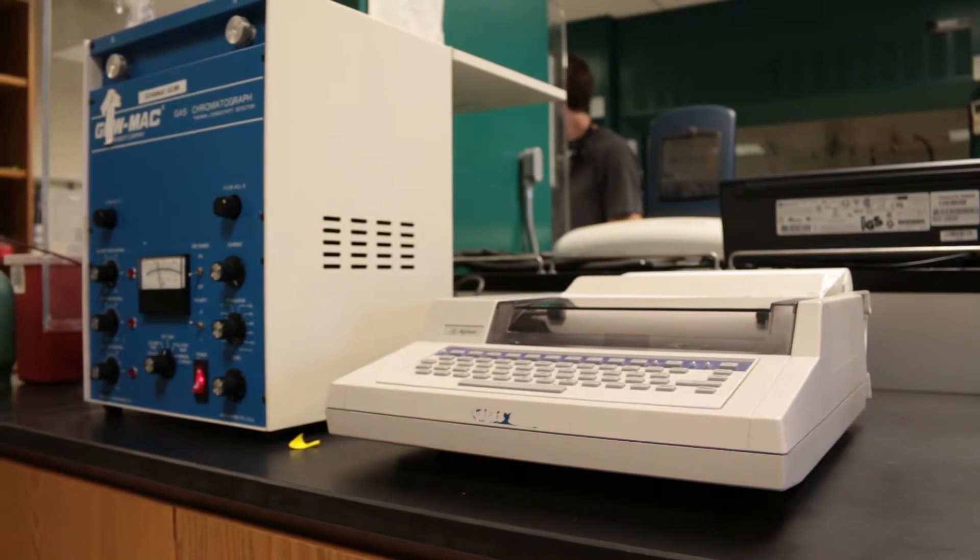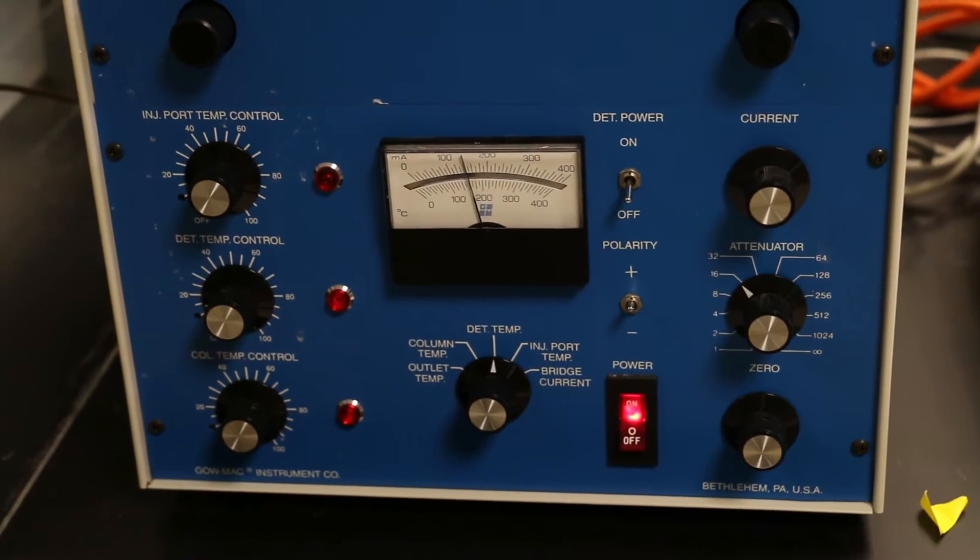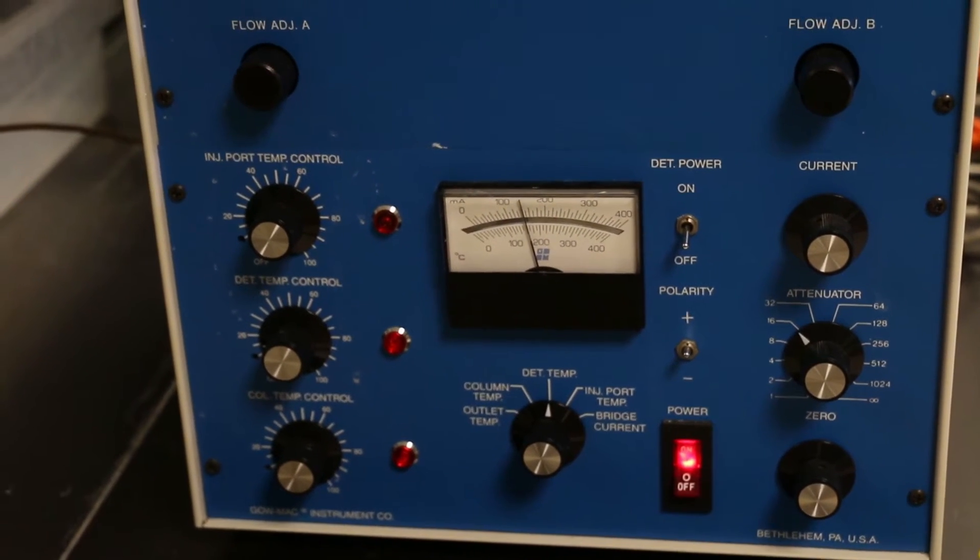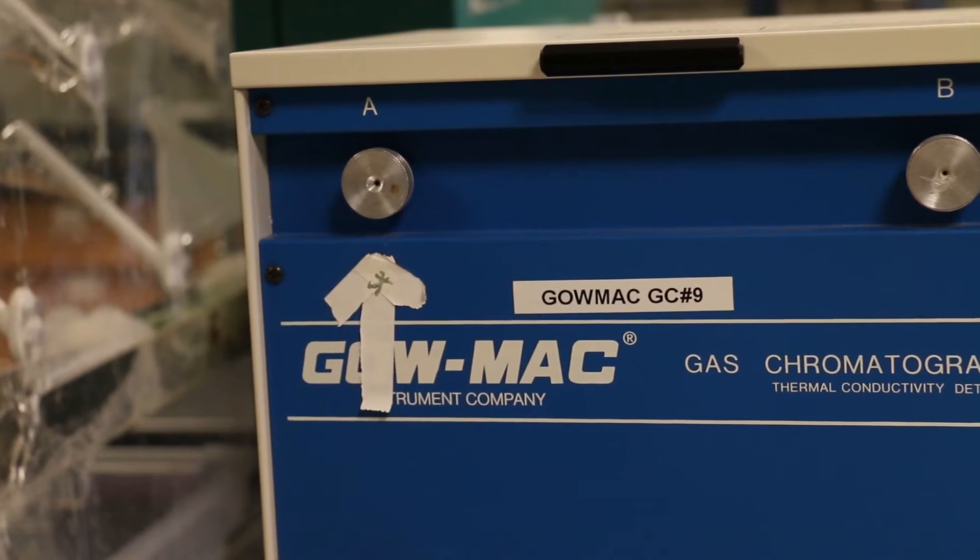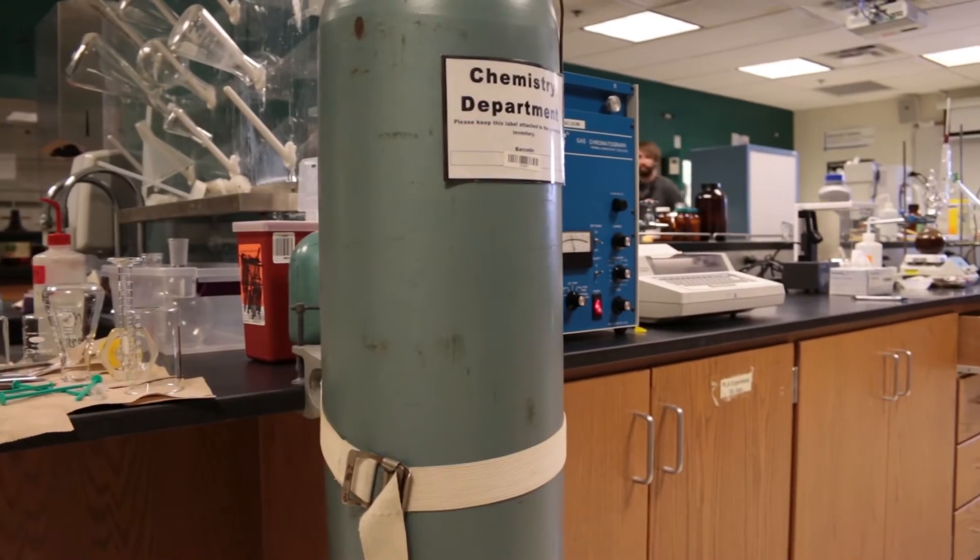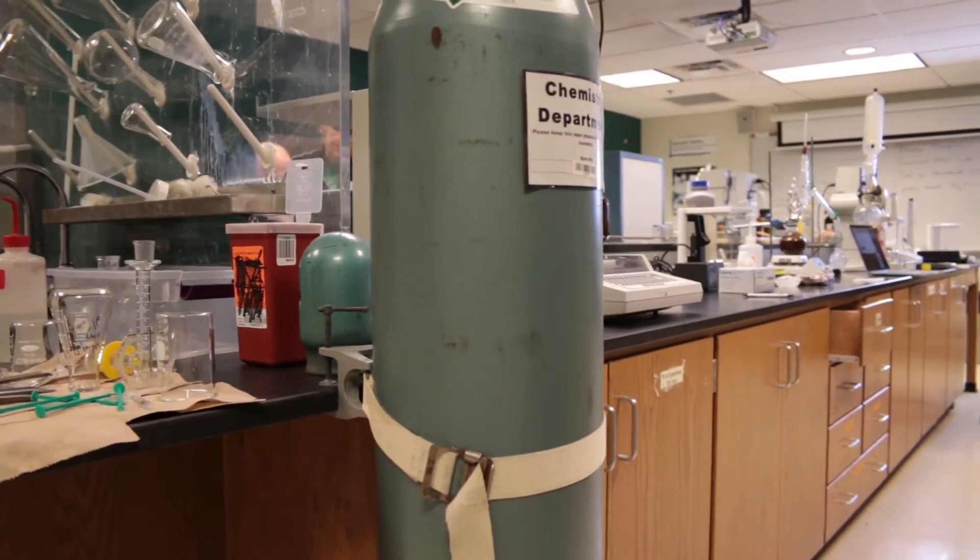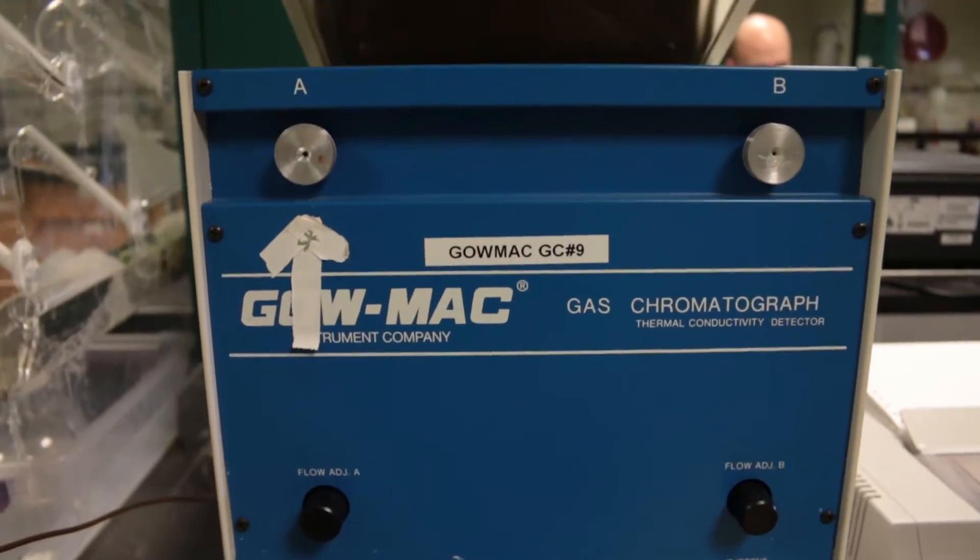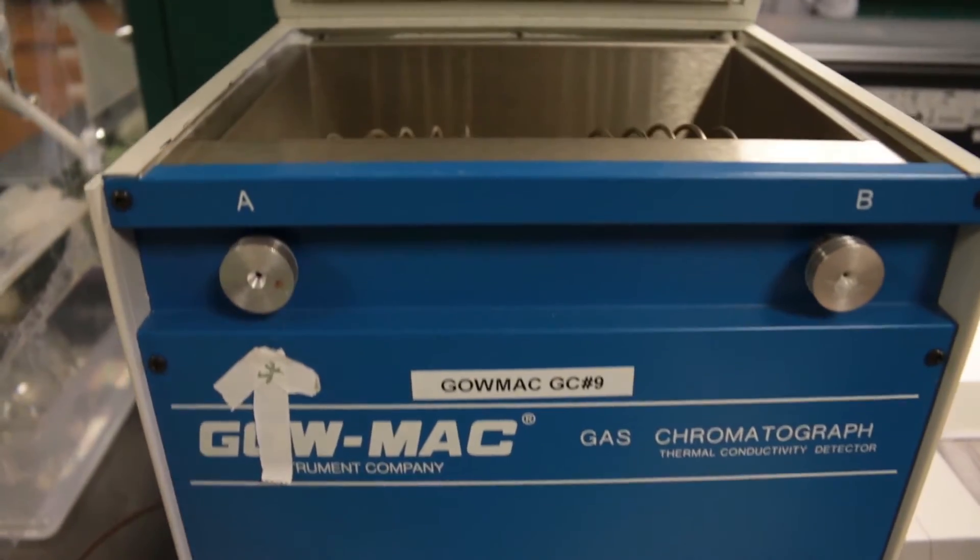The gas chromatograph uses the principles of chromatography to separate mixtures of compounds between mobile and stationary phases. The mobile phase in a GC is helium gas. The stationary phase is a waxy liquid coated on a solid and packed into a long column inside the GC oven.